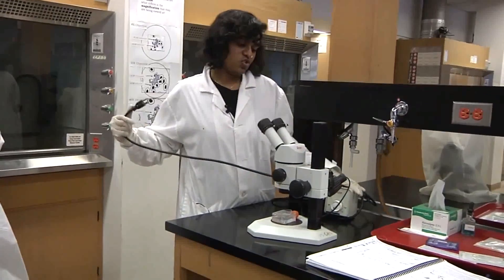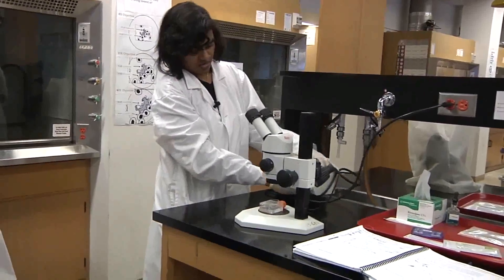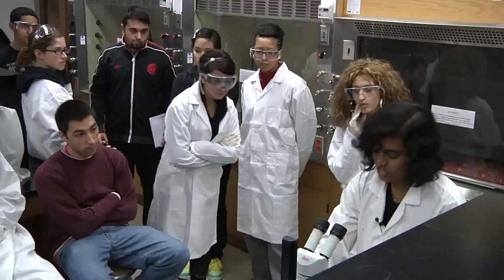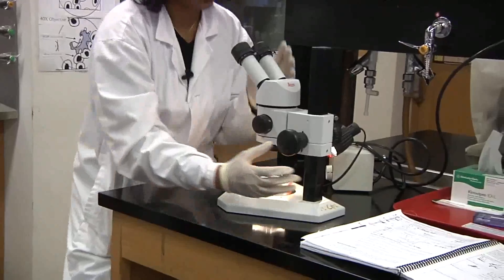First thing to do with a dissecting microscope: switch it on, and switch on the light. Go to the lowest objective, and as you can see, most of the specimens are visible to the naked eye, so try to position one of them beneath the objective.